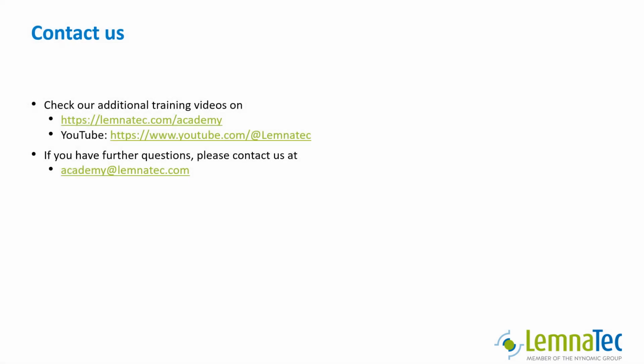This is the end of class 2 of our software training, at least for now. We may add more videos here in the future as we add software features which are relevant at this stage. We will continue the software training in class 3, where we will tell you more about creating analysis with LemnaGrid and how to integrate them into the workflow with LemnaExperiment. See you there.